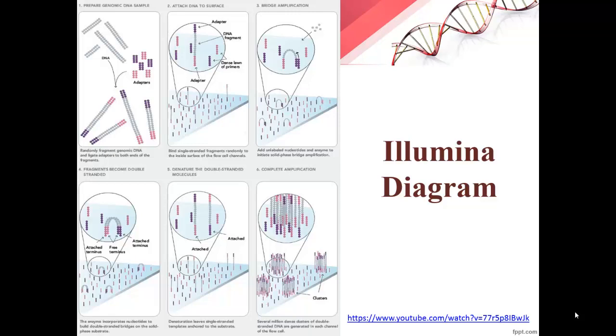The images used in this video were created from Illumina, which utilizes bridge amplification in their sequencing. The link at the bottom right is a video by Illumina, which gives an overview on the steps used before amplification, as well as a great visual demonstration on how bridge amplification works.